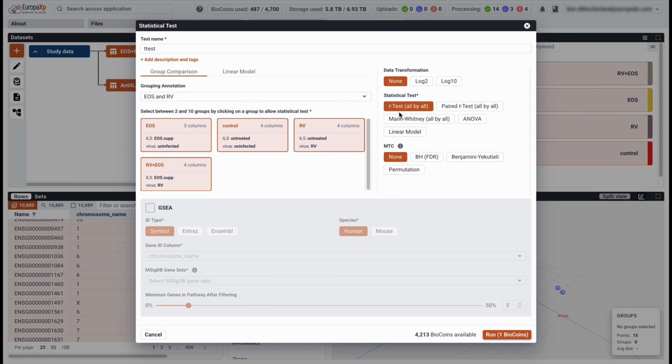Additionally, it's standard to log transform RNA-seq data before statistical tests due to the skewed nature of the counts. Because we're running across thousands of genes, we're also going to apply a false discovery rate correction using the Benjamini-Hochberg method. This again follows what was done in the original publication.